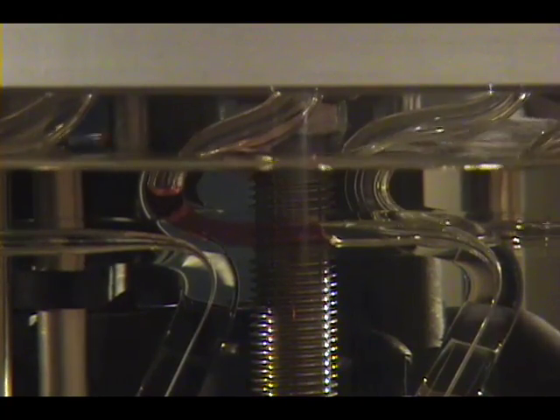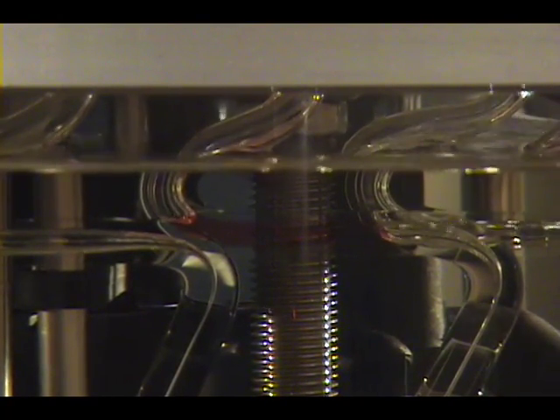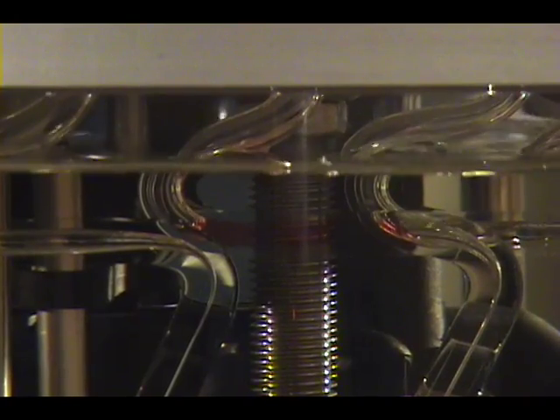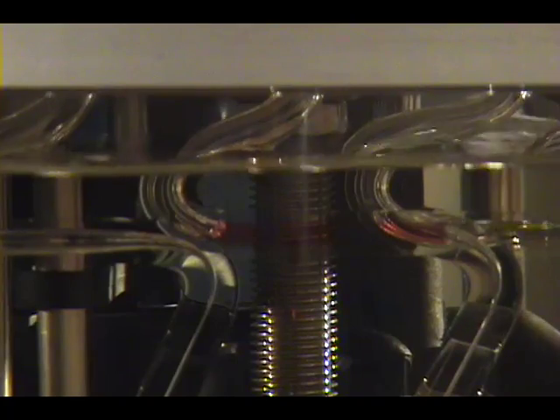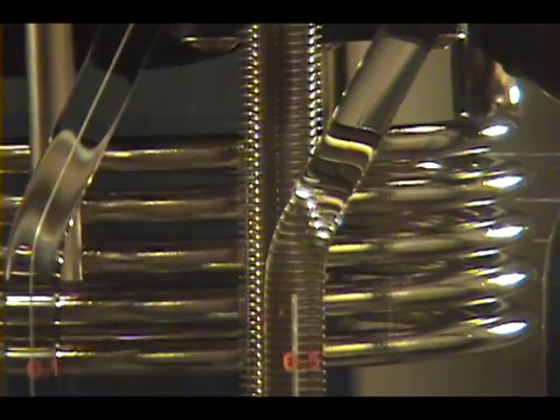The sample flows down into the horizontal arm of the tube where it quickly warms up to test temperature. The sample then flows into the capillary of the tube on its way to the first optical sensor.